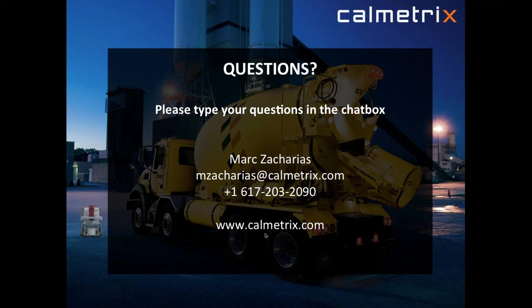Okay, other questions? One thing I'll mention while we are waiting for other questions, back on the weight of the instrument and the need for its stiffness. It's not only related to vibrations. You need a stiff instrument so that as you make these measurements at high torque, the instrument is not moving because of the high torques that we have to use for very stiff type materials. It's important that all of the torque goes into the sample and the measurement rather than bending the instrument itself. So that's another reason why it has to be so heavy and so stiff.